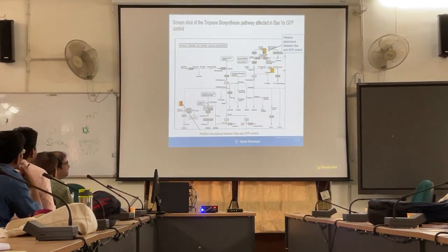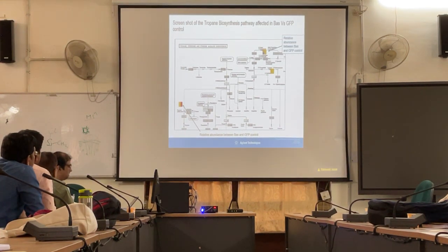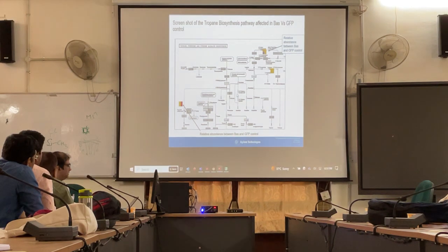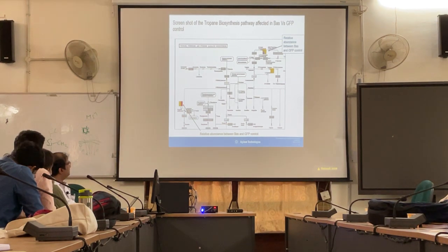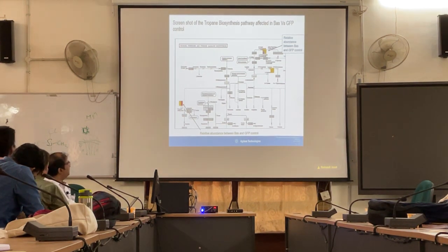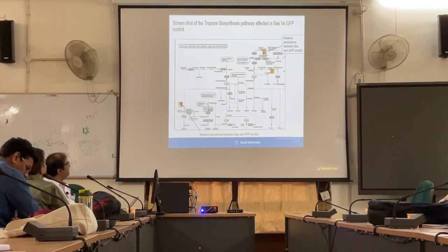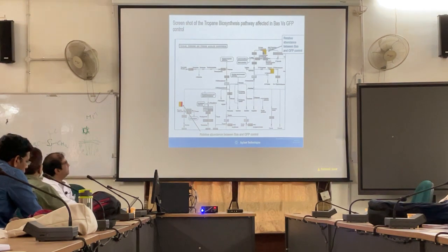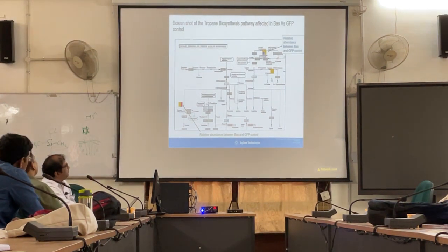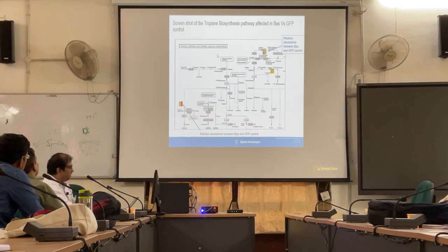So you are getting the abundances of these compounds. It is a relative abundance which is here for this compound. In one sample it is low abundant, in both the duplicates, in another sample it is expressed higher. Similarly for some other compounds in this pathway. So all this is possible.